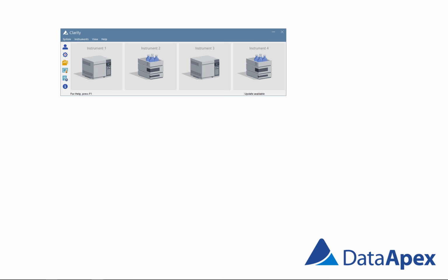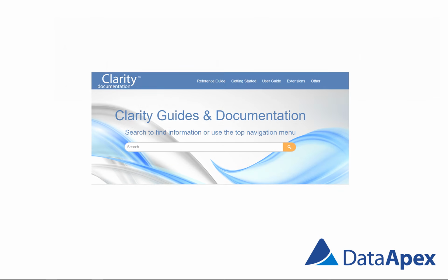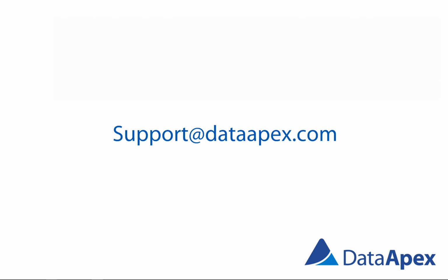And this is basically the end of the brief introduction to the Clarity software. I hope it gave you an overall picture. For more details, please check the related tutorials. And if anything remains unclear, you can always press F1 to show help, go through multiple guides and documentations on DataApex.com, or contact our support department.